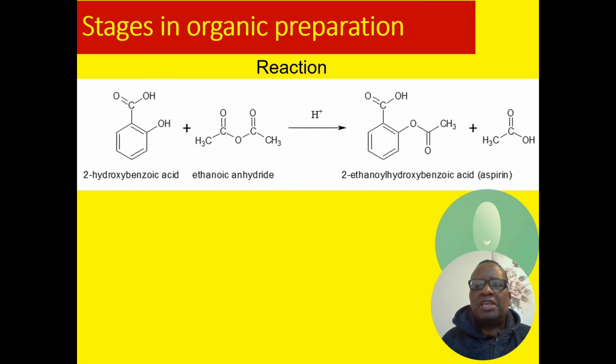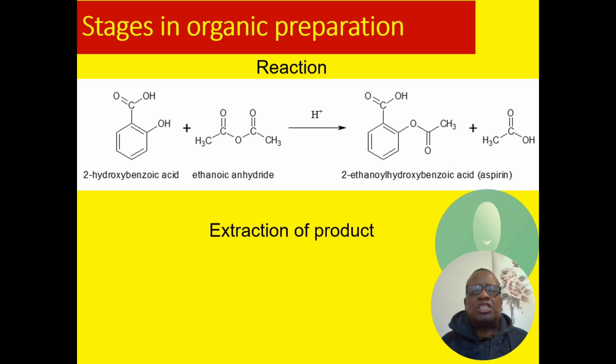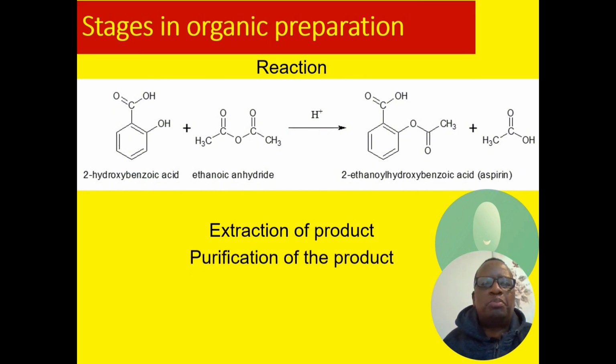So the next big thing that you want to think about is, how do I extract this product? And after that, you need to purify your product. You don't want to start selling impure aspirin, do you? So reaction, extraction, and purification are the three most important stages in synthesis.